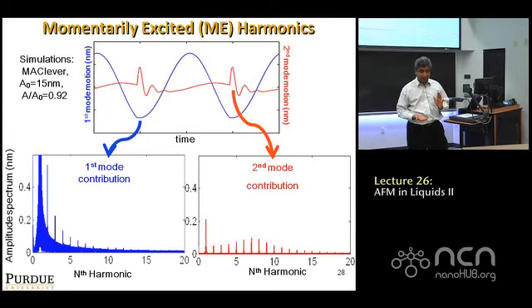If you think about it, it goes into two sources. One is the forces between the ball and the surface are non-conservative, are dissipative. So during the interaction, there's some energy loss there, right? But the second source is the fact that during the collision, some energy was transferred to this internal ringing also. So we'll come to this in a second. It's actually a very fundamental topic because most people, when they study collision of two objects, don't take into account internal degrees of freedom, right?